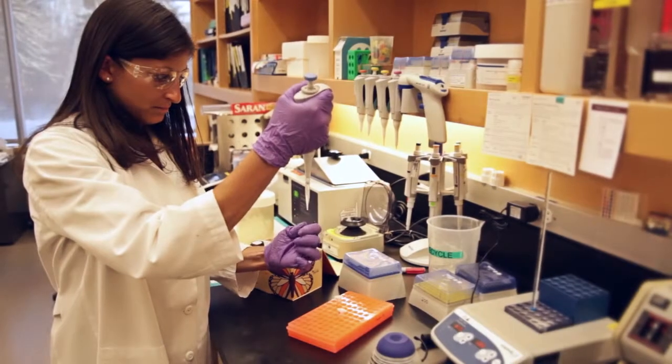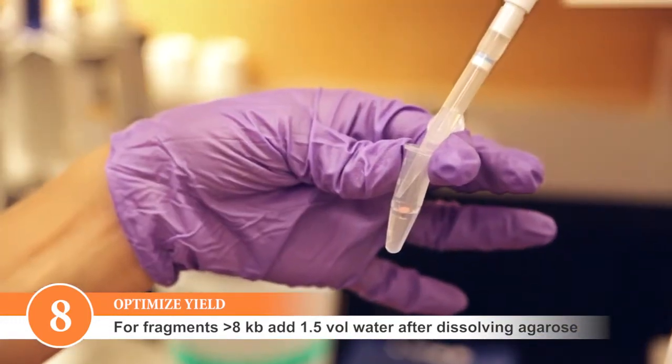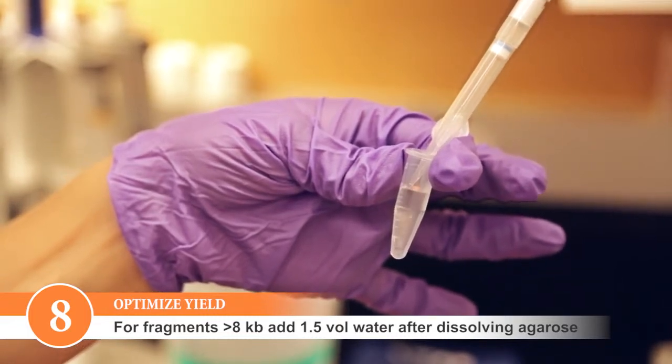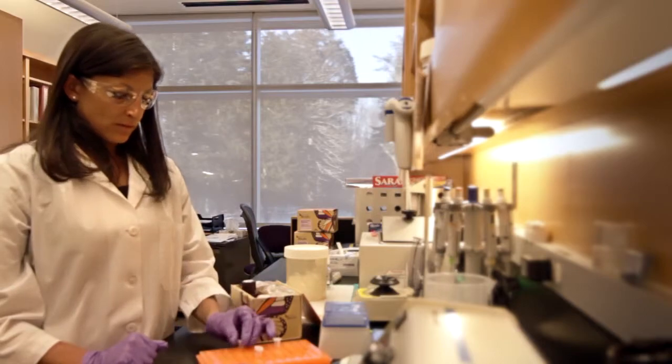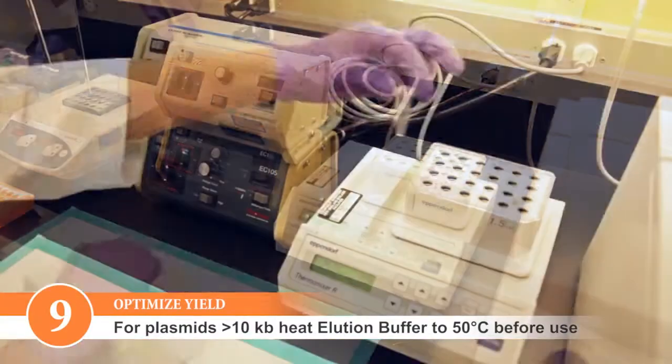For fragments that are 8 KB or larger, we recommend that you add 1.5 volumes of water after the agarose is dissolved. This mitigates tighter binding of the larger DNA pieces to the matrix, allowing easier elution off the column.